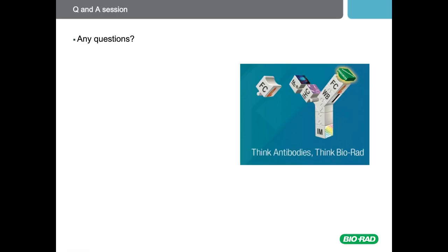The final question I have here is about pulmonary macrophages, harvesting them from tissue culture plastic. They'd like to know whether these can be removed by scraping because they're quite adherent, and if this will cause a loss of viability and increase debris. Yes, scraping will usually result in these kinds of problems.